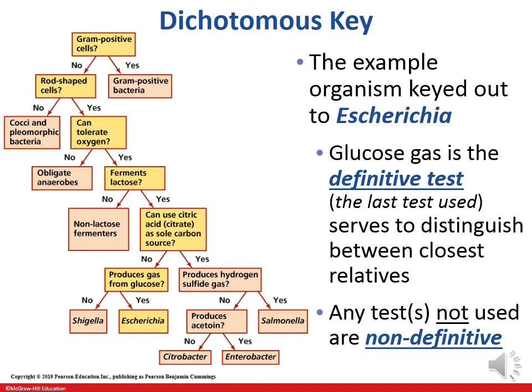So keep that in mind. That's how you're going to use these dichotomous keys. This is really the process that you're working up to for the lab practical. And so in your unknown ID lab exercises, you're basically going to be collecting data all semester long so that you can do exactly this on those unknown specimens that you're working with this semester. But keep in mind, you're going to be practicing this along the way. Every test, you'll have unknown specimens to key out on the test.